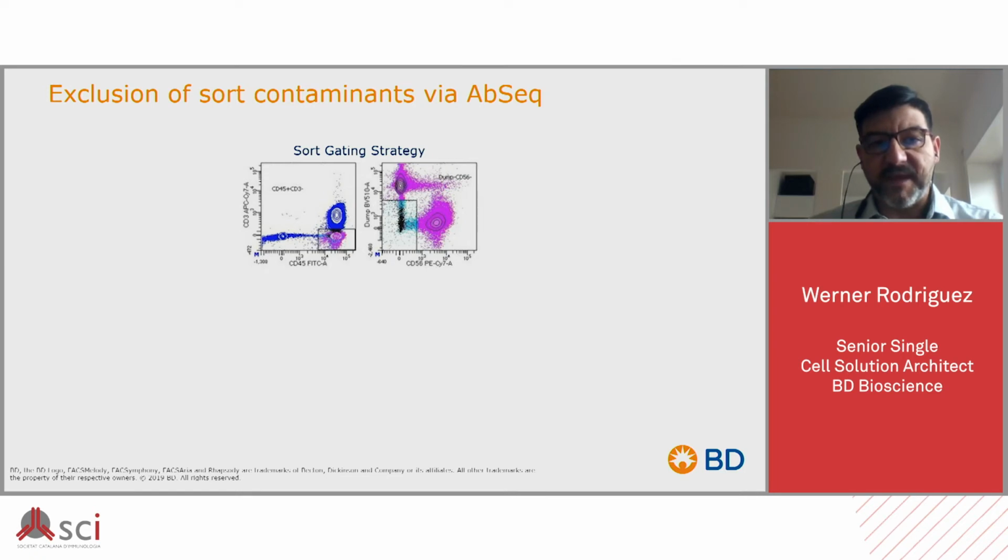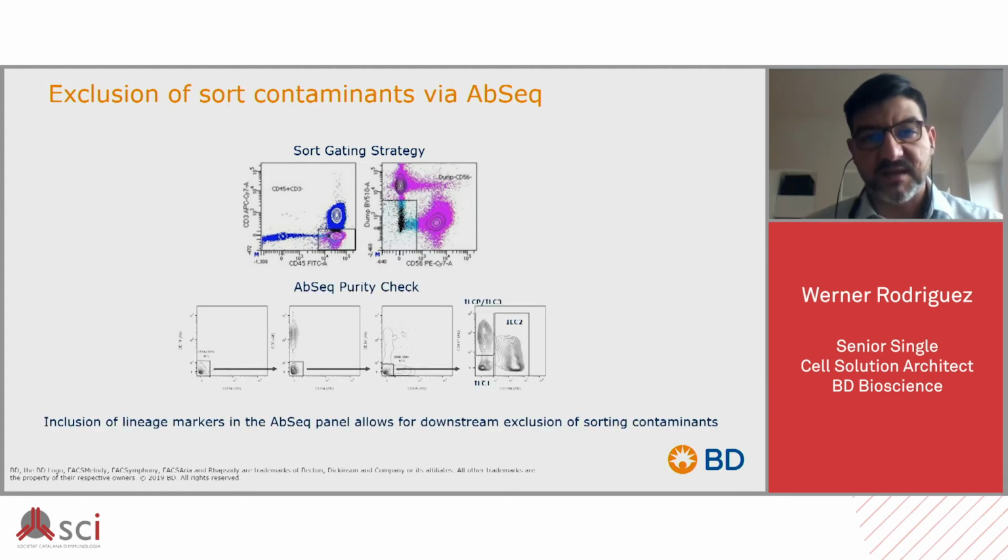It is a very well-known procedure to double check, once we sort our samples, that the sorting has been done well. One of these procedures is to re-sort our samples, making them go through the sorting process again. But of course, this could be challenging with samples with a small amount of cells, and also with cells that are very sensitive to this process.